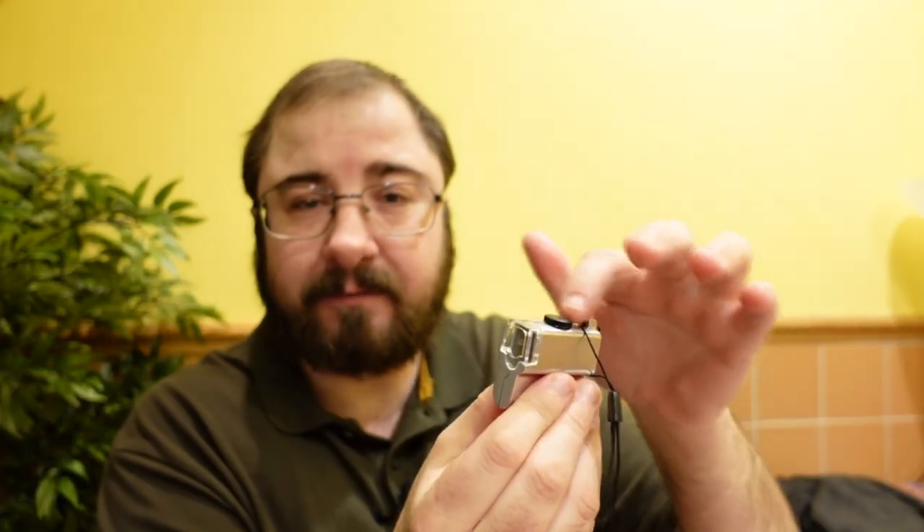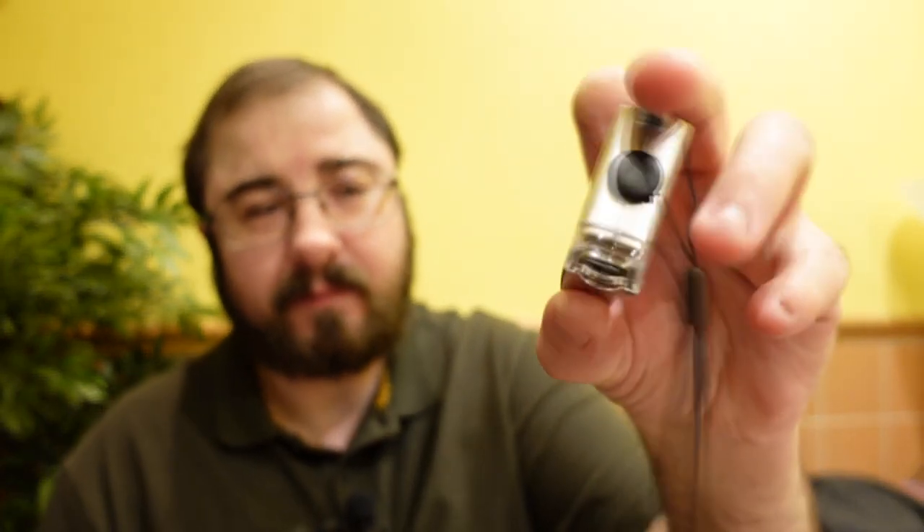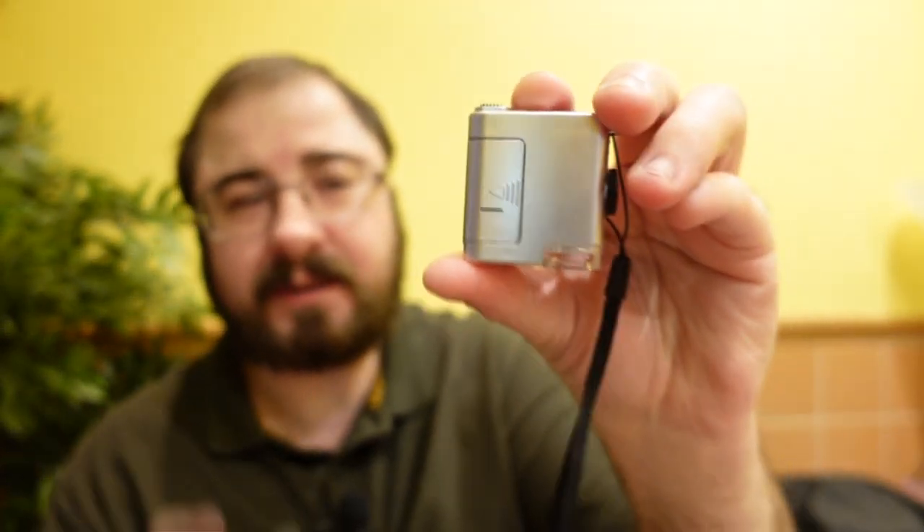I have discovered that you can use this without the light — it's not a problem. If you've got a really glorious day or an external light of some description, then you don't really need to use the light on the microscope quite so much. That is a little focus wheel on the top, and that is where your battery compartment is.